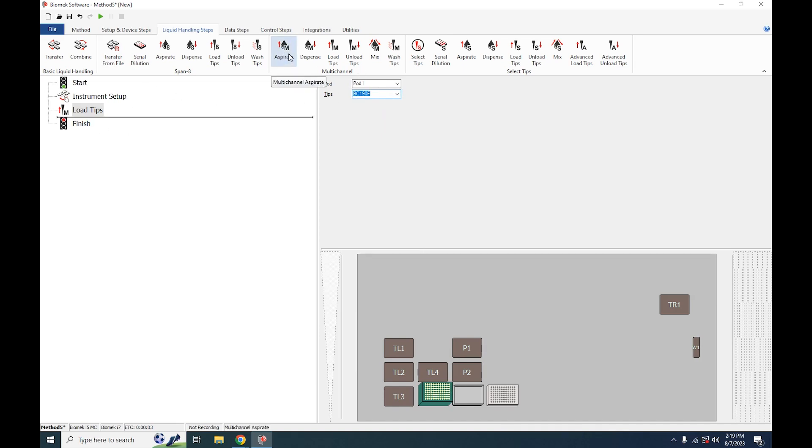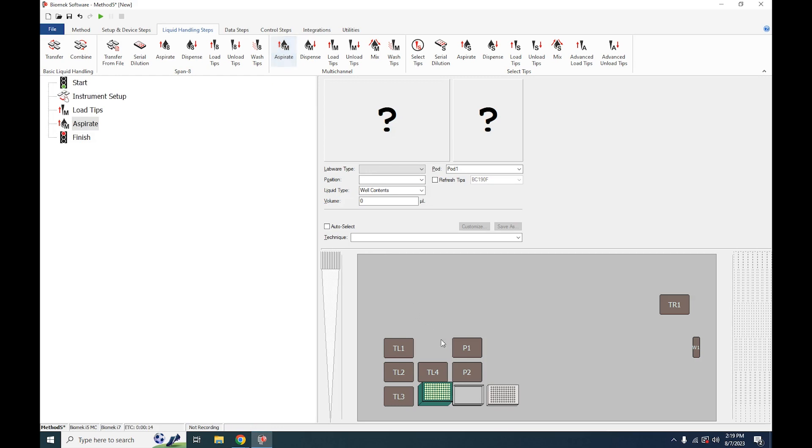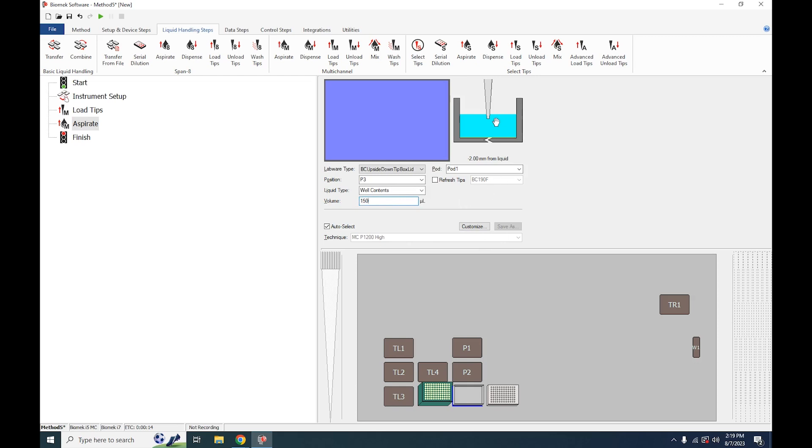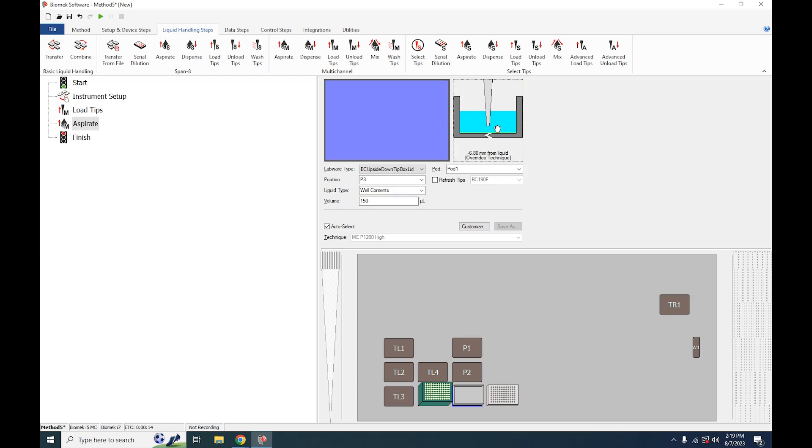Next we will select Aspirate. Click on the position we'd like to aspirate from. Auto-select a technique or choose whichever technique you'd like. Define how much volume you'd like to aspirate. In our case we're going to choose 150 microliters. And also drag or leave this position to choose how far from the bottom you wish to aspirate.